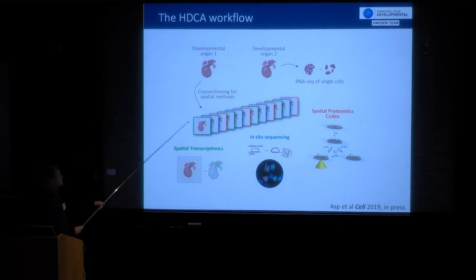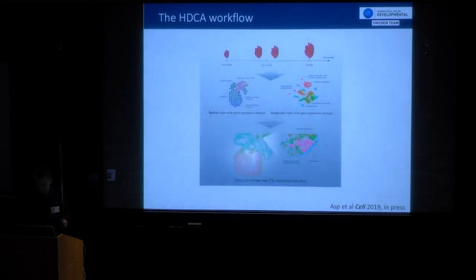So practically what we do is that we are sectioning our samples, which are extremely precious, obviously, for the different technologies, ST, combining that with in situ sequencing and doing proteomics on this. And combining that with some data-driven analysis of single cells. And together, we are creating a very rich resource, and this was recently accepted as a resource in Cell.